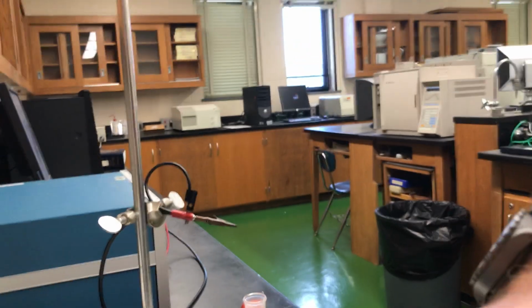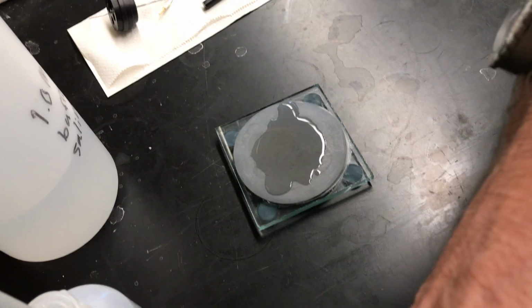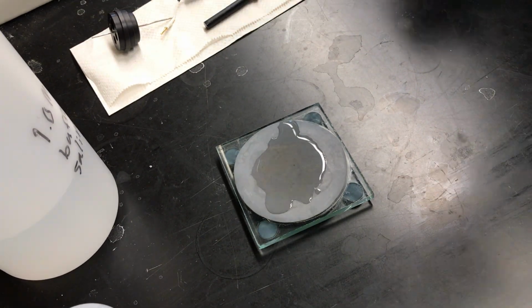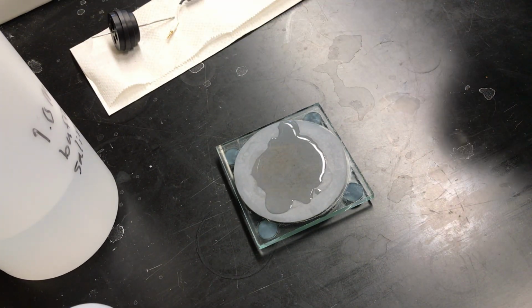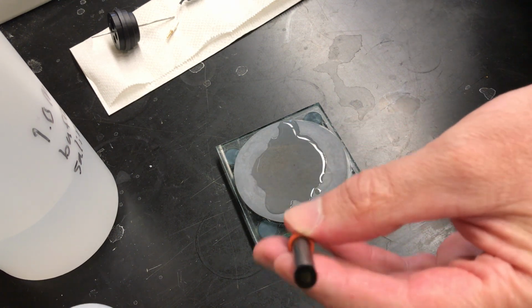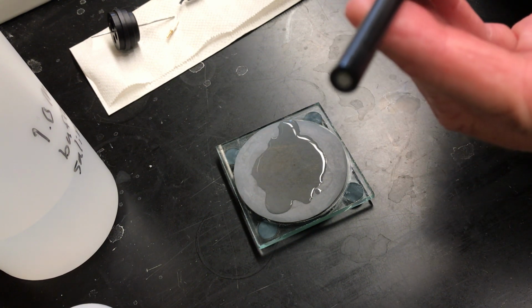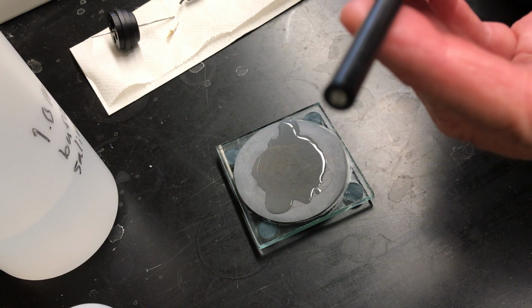All right, so a few things that we have to do to set up first. I'm going to set up my tripod so that I can get both hands free here. So I'm going to focus down on this region right here. And what we need to do initially is clean the working electrode. So you see here the working electrode. Now you might be able to see it here, but there's a glassy carbon disc on the end. I think you can see it right there.